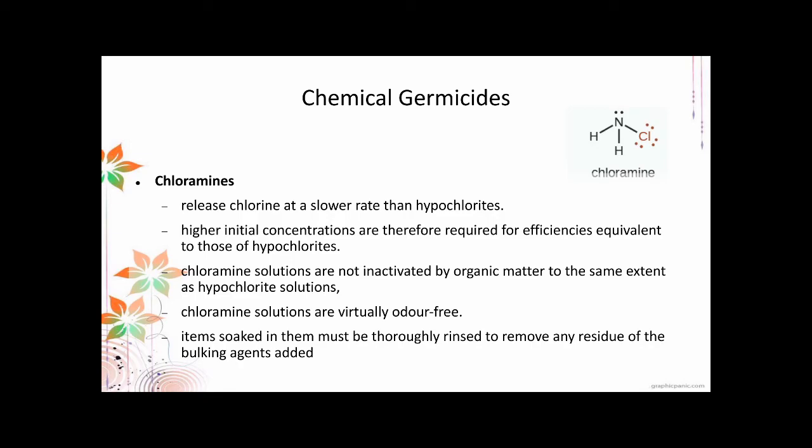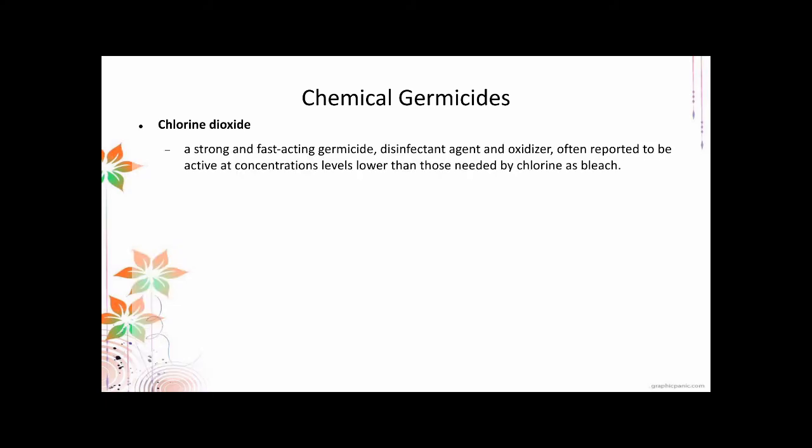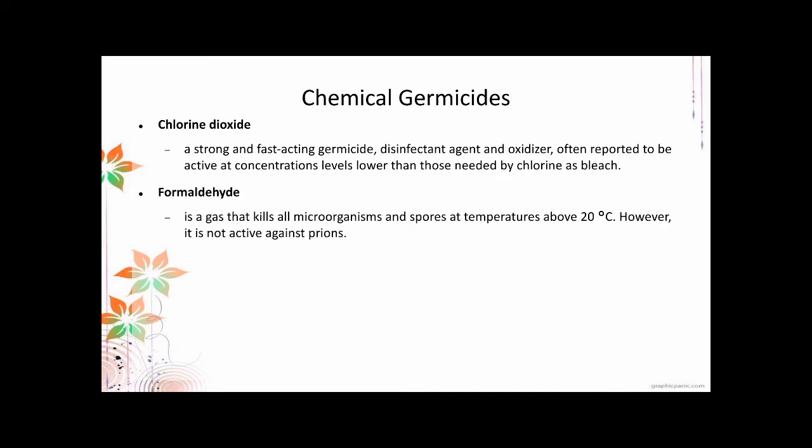And of course, the soaking time is longer. Then you have chlorine dioxide, which is a strong and fast-acting germicide, disinfectant, and oxidizer. It's often reported to be active at concentration levels lower than those needed by chlorine as bleach. But since it's gaseous, it has its own health risk.